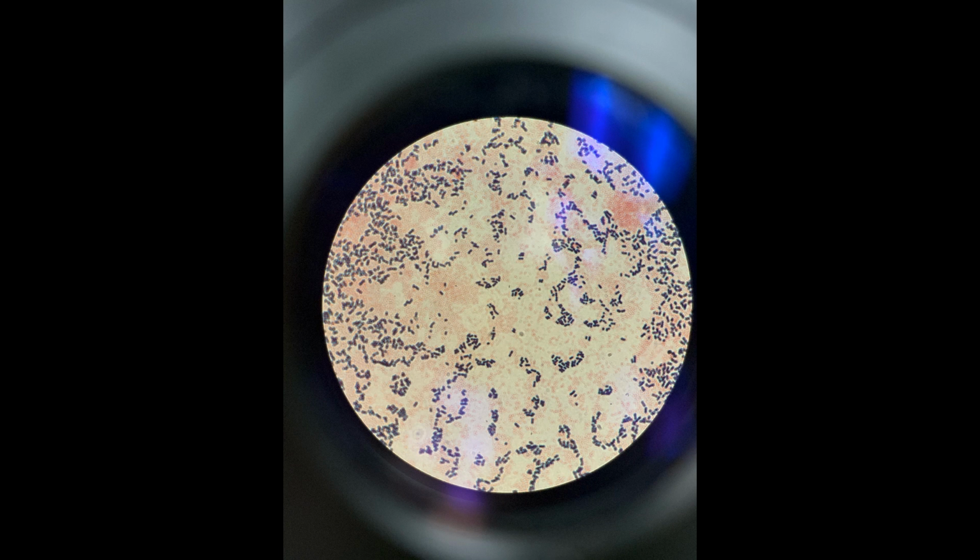So my mixed culture is Enterococcus, which is the gram-positive, or purple, coccus-shaped bacterium. My gram-negative cells, the pink ones, were Acinetobacter baylyi. So Acinetobacter is this genus of bacterium that have what is sometimes described as a coccobacillus shape. So they're not as long as something like E. coli or Klebsiella, and they're going to look kind of in between a coccus and a bacillus. And so those are all the pink cells mixed in with the purple.